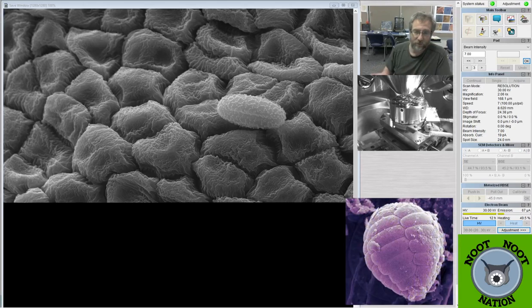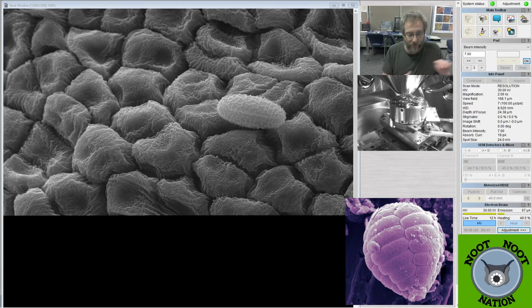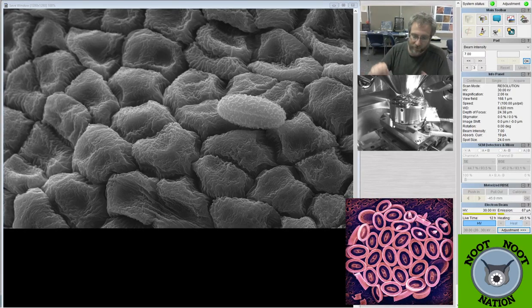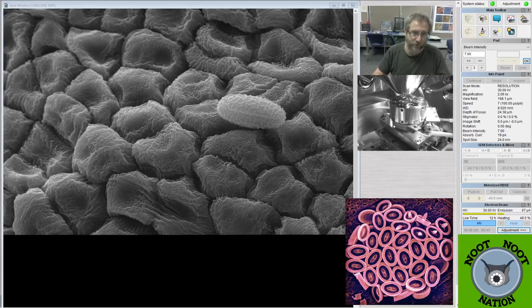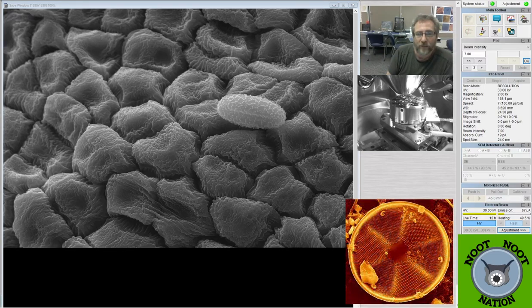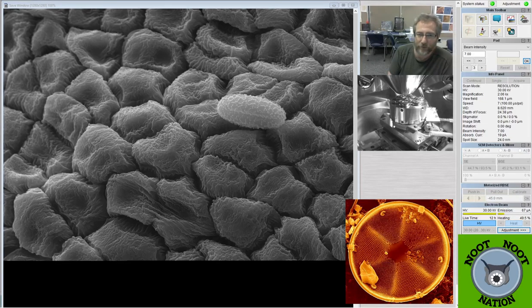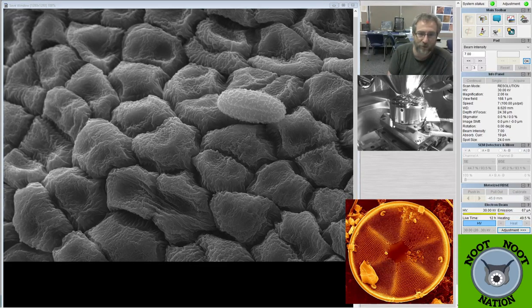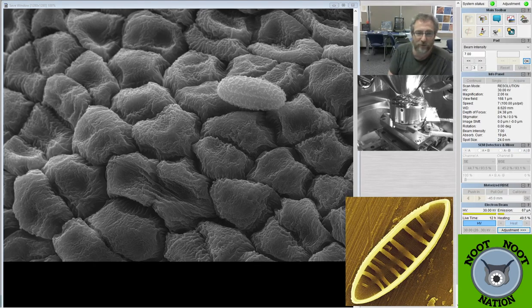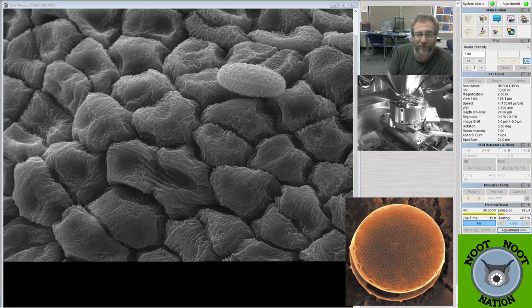But I did document each plant that we collected when I mounted it, so that we could link them back to specific plants. So I know this is a leather leaf because I went out and imaged the leather leaf and collected the sample from it, and then I just wanted to photo document, okay, I have this plant, now what's it look like in the SEM? Most of the time, for the last couple of months, I've been looking at diatoms and doing real analysis. I've either got grad students in here working with me, or I'm working on projects. I do that most of the time, but occasionally it's fun just to put some other things in there. Sometimes we just look at random things people want me to look at.